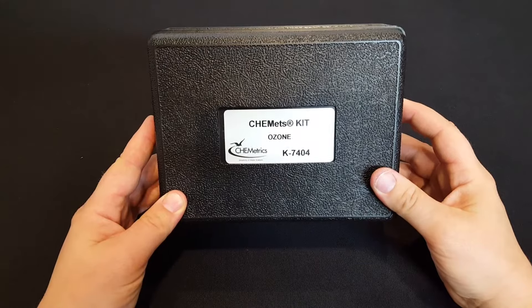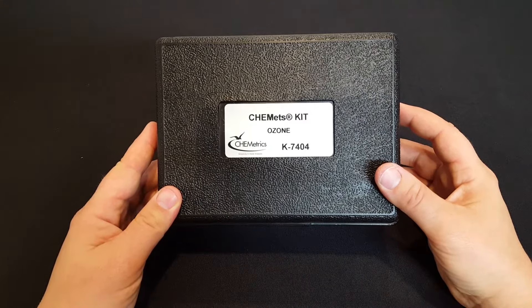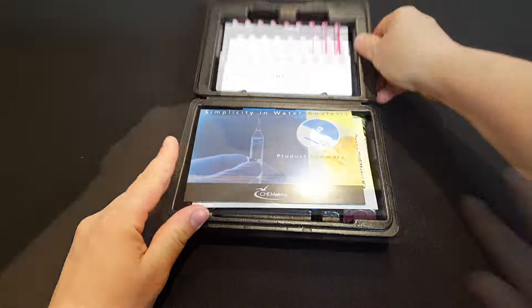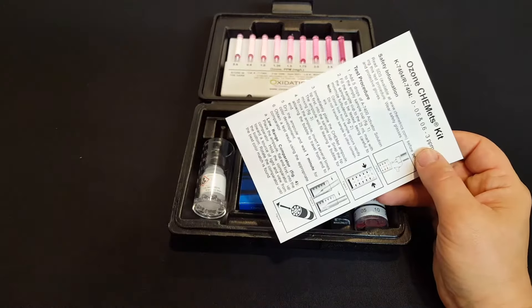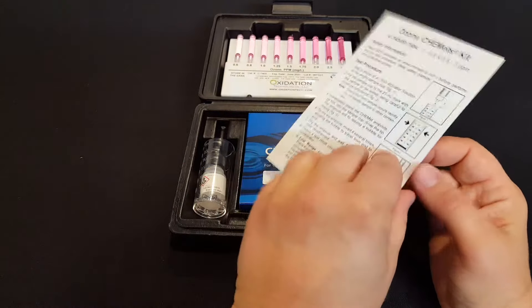This is the K7404 Color Comparator Test Kit for measuring dissolved ozone in water. There are two pieces of paper that you'll see right when you open the kit: one is promotional literature and the other is step-by-step instructions on how to take the test.